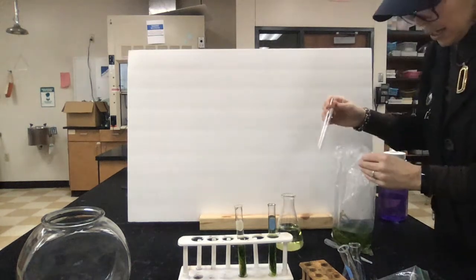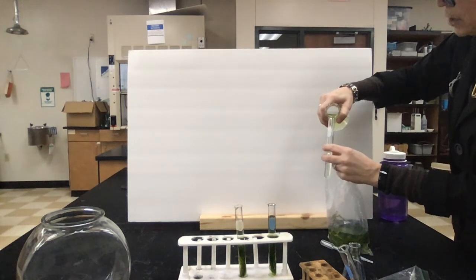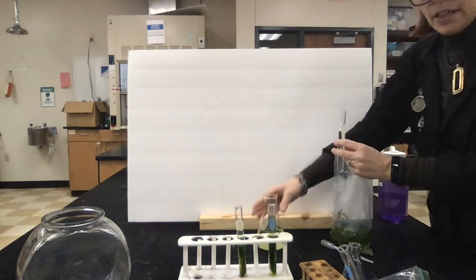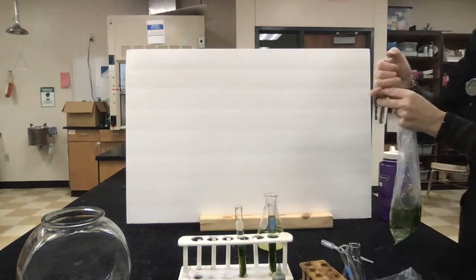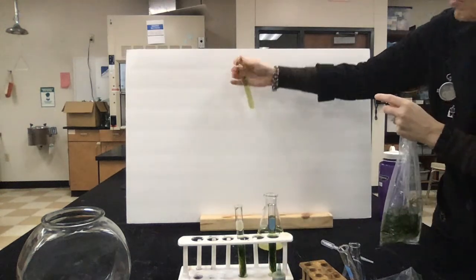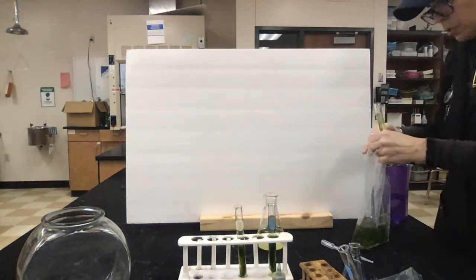All right, and then one more. We're going to fill with yellow water. I'm just repeating the experiment so you can be sure that this is legitimate. It's like adding extra trials to the experiment. I'm adding more color so we can see it a little bit better. So hopefully you can tell that's definitely not blue. It's more at the intermediate level.